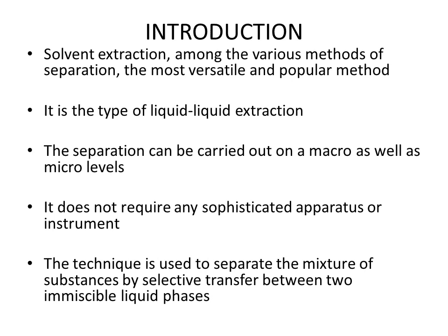So we can separate our compound which is present in the solution even in traces or even in large amounts. It does not require any sophisticated apparatus or instrument. Another advantage is that the apparatus is quite simple.